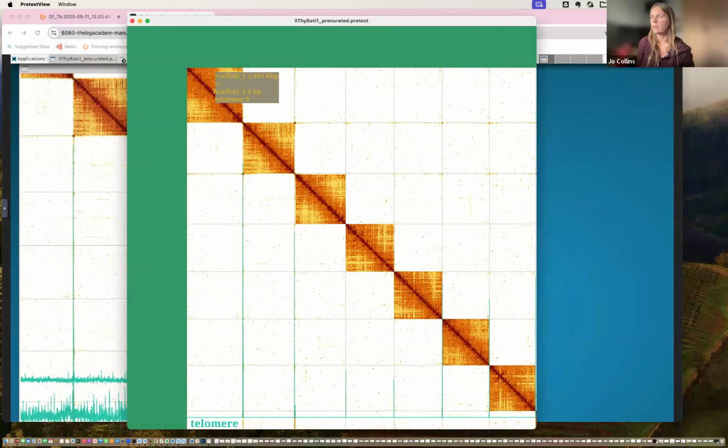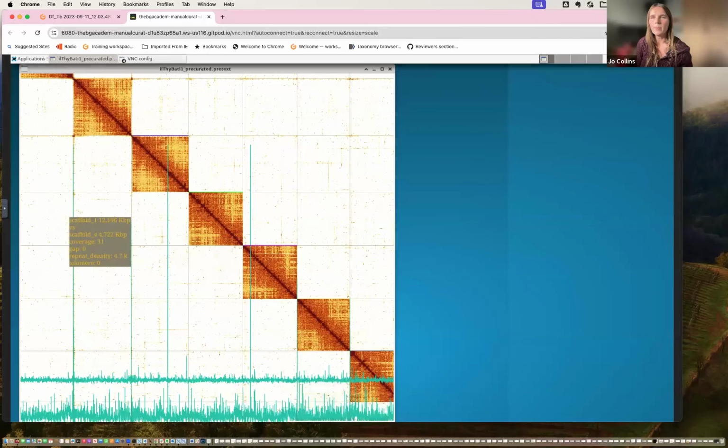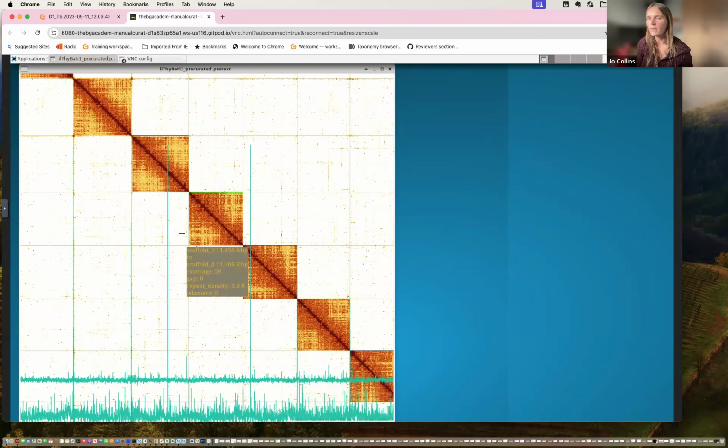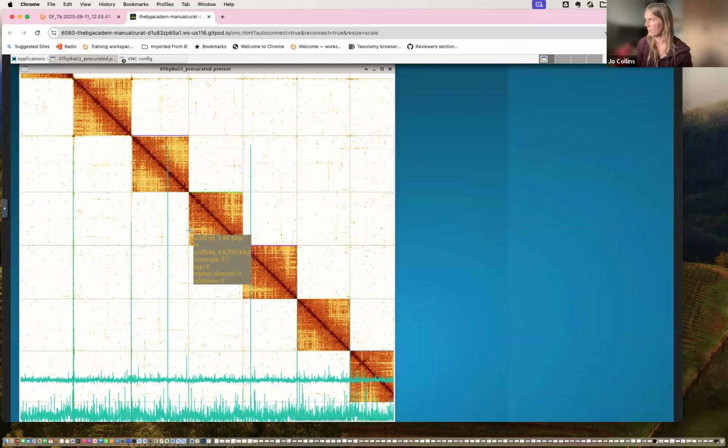Right, let me just return back to this. Can you all see the whole metadata tag menu? Curators, sorry, or are you having the same issue as I am? I can see it all.